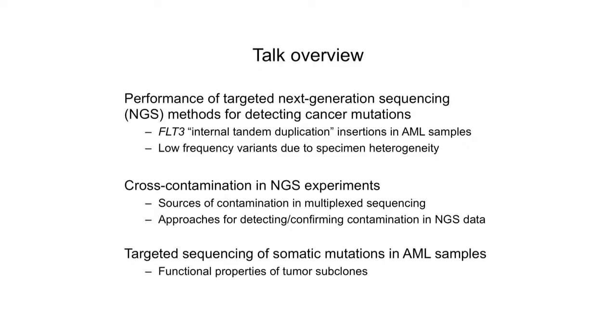And then finally, I'm going to talk about a recent publication from Tim Ley's group, which I've been involved in, on targeted sequencing of somatic mutations in AML samples to try to understand if subclonal cell populations have any sort of functional properties that may ultimately be clinically useful.